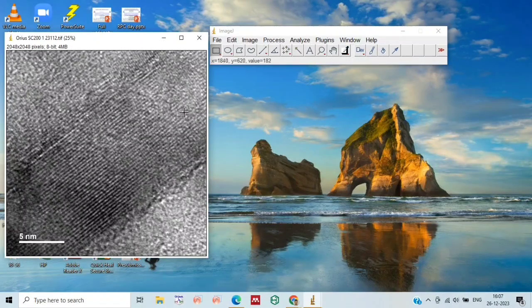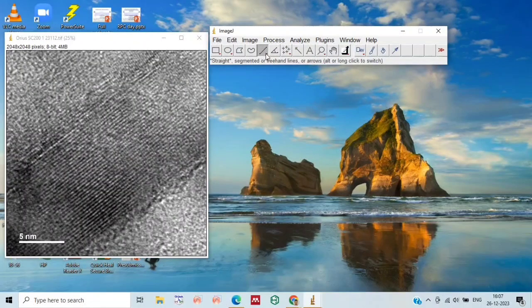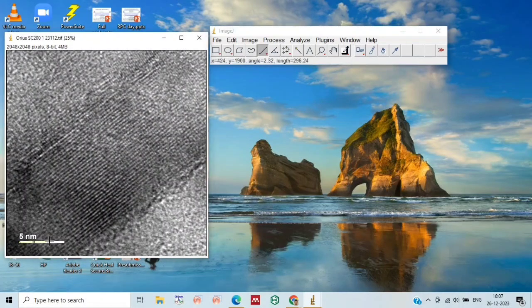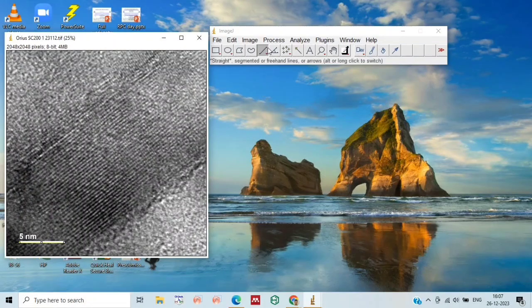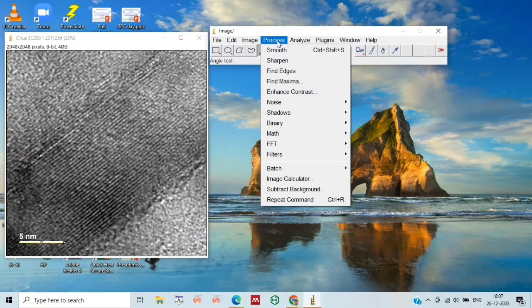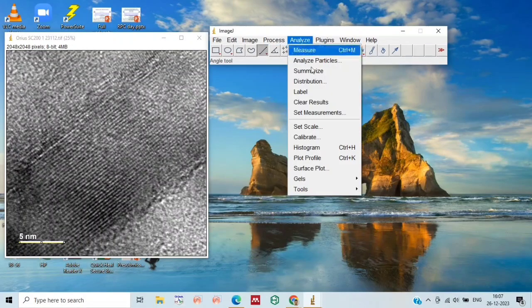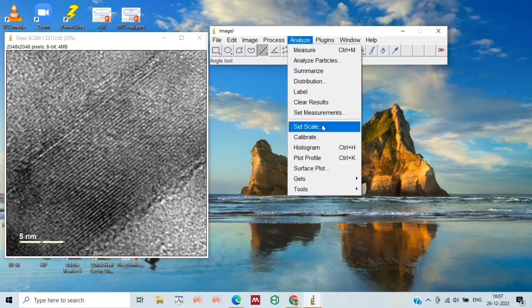Now what we do is we will select the line button and then drag it over this scale bar like this. Now we will go to Analysis and then Set Scale.